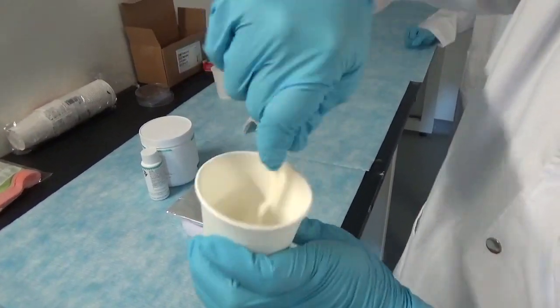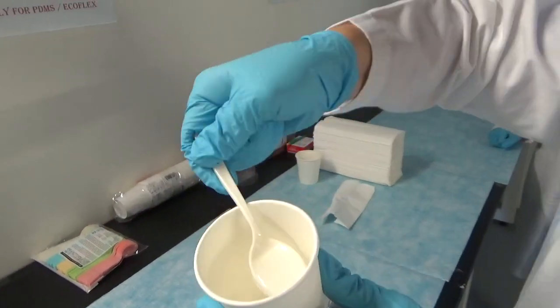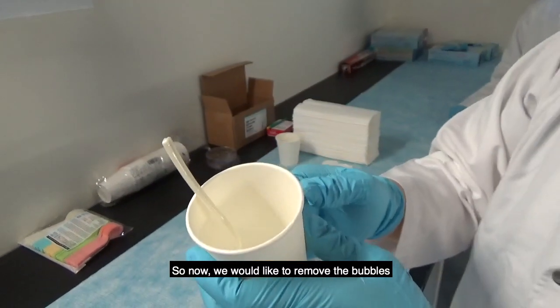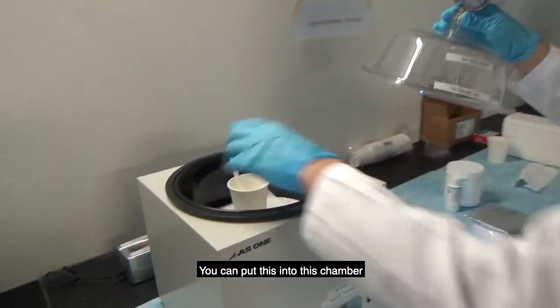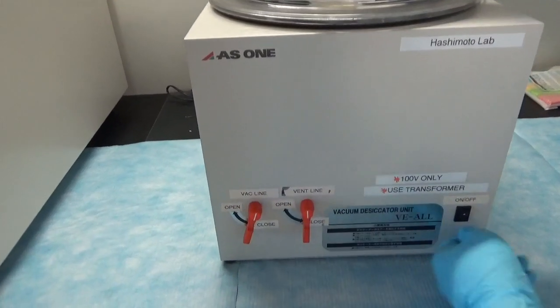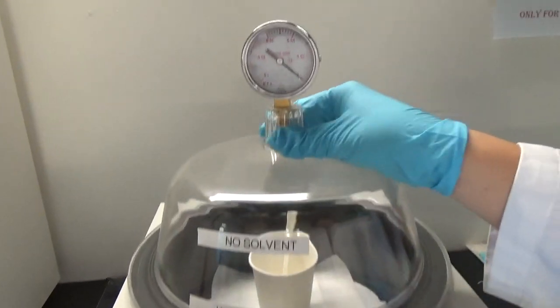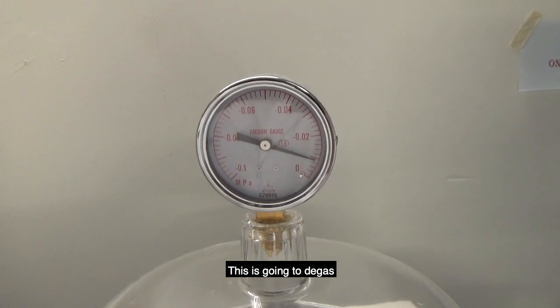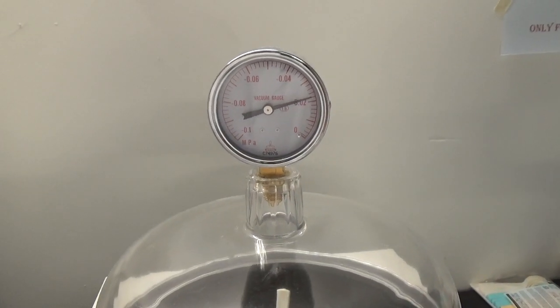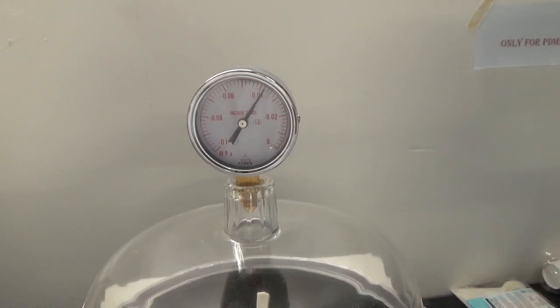Now you can see the mixture is really bubbly. After mixing both chemicals together, they become very bubbly, so we want to remove those bubbles. Place the cup into this chamber — this is called the vacuum desiccator. Put the top on, turn on the system, and open the vacuum line. This will degas the mixture; the inside of the chamber is now at lower pressure, so the bubbles will rise. You have a meter here that will decrease as it approaches full vacuum.